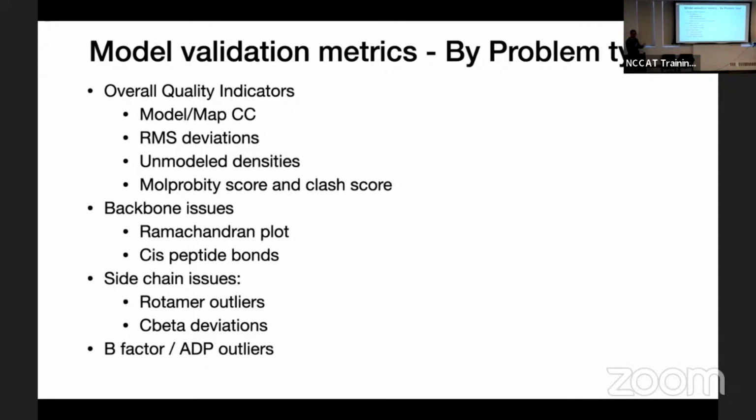So often we're really focused on the protein itself, and it can be easy to miss nearby densities that could be peptides, small molecules that have co-purified with your protein, or perhaps a part of your protein from somewhere else that has gone into a disordered region and reappeared over here and then gone back. So checking out those unmodeled densities.